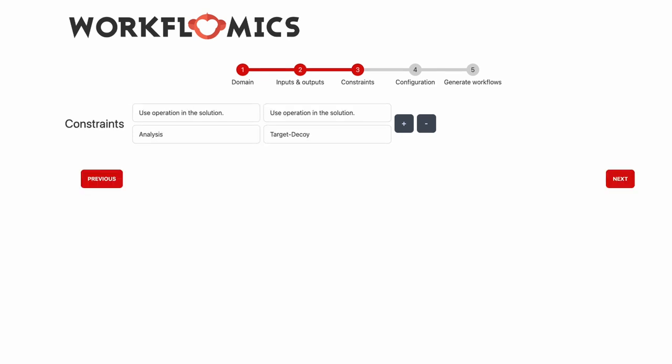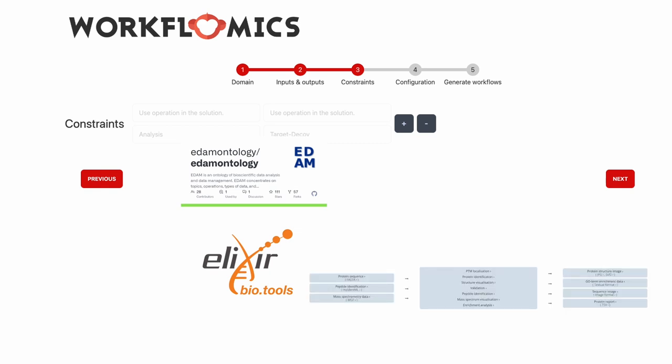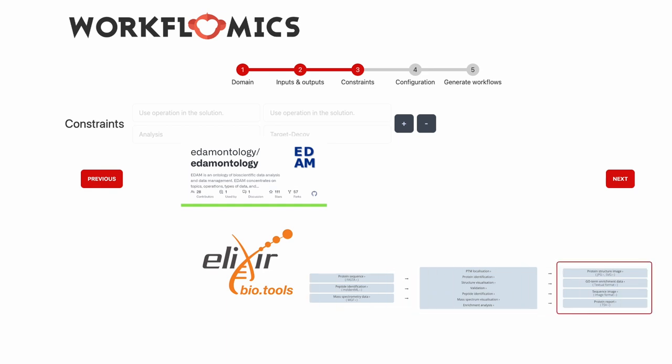In addition the user can specify constraints to guide this automated creation of workflows. In our example we would like the workflows to perform some type of analysis and target decoy. All the specified constraints are annotated according to the EDAM operations and the corresponding bio.tools annotations. And as we know in bio.tools each tool is annotated with a set of inputs that specify types and formats for each of them, and a set of outputs where each is specified again according to the EDAM terminology.